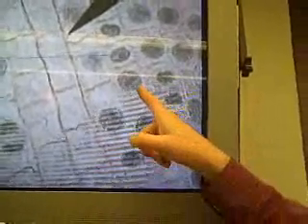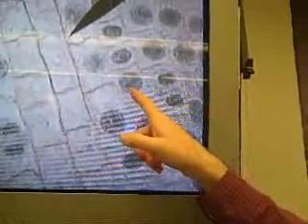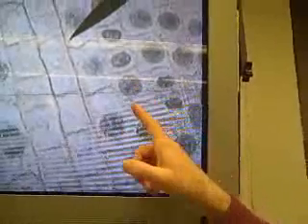Remember, the nucleolus makes ribosomes. So if a cell is in interphase, there's not going to be any visible chromosomes. The nucleus will be dark in color, and you may be able to see the nucleolus. You'll see a definite nuclear envelope. So that is interphase. Okay, and during interphase, all the contents of the cell will replicate, including your chromosomes. So your chromosomes will go from being single-stranded to being double-stranded. However, you will not be able to see individual chromosomes.